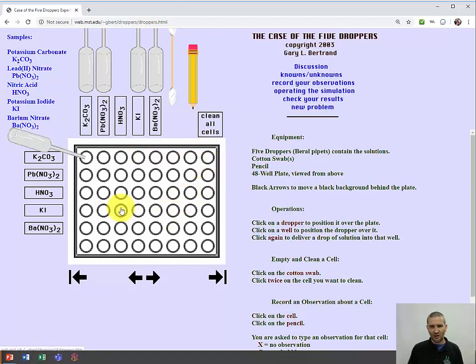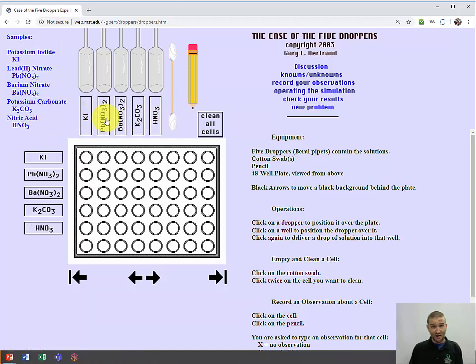Once you've done this and you've recorded observations for all of these mixtures where you know what you're mixing, you're going to go over here and click the unknowns. And I'll also point out this list and this order is going to randomize slightly from time to time. Let me just show you that by hitting F5 to refresh it. You'll notice these just changed a little bit. The positions are all changing each time. I'm getting different substances. So we will see some changes when we do this.